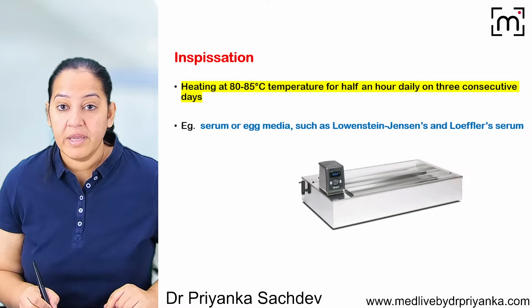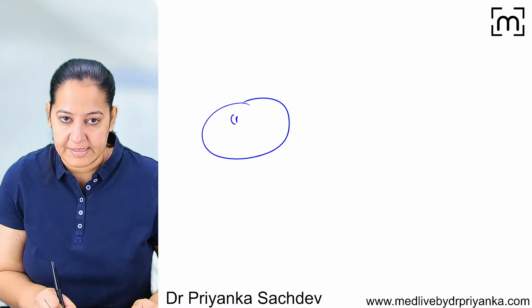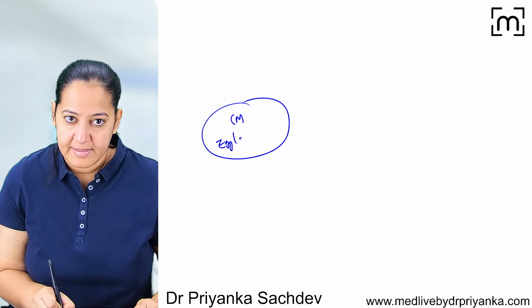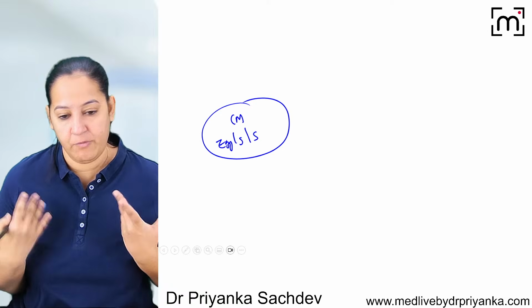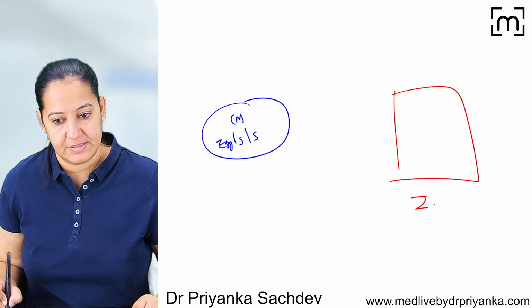Listen. So here I am having a culture media. This is a culture media. It is not a normal culture media. This culture media contains egg, serum and sugar. I want to sterilize it. So I will use an instrument. The name of the instrument is Inspissator.